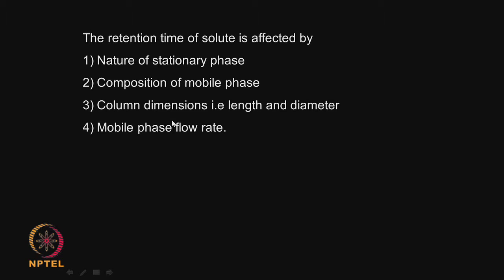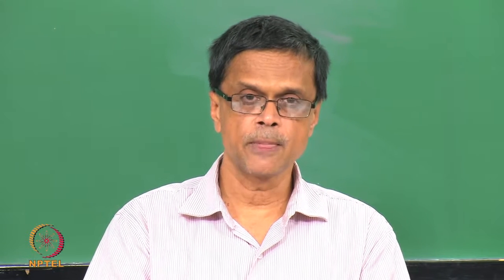Then column dimension, what is the length of the column, what is the diameter of the column. Then mobile phase flow rate, how fast or how slow the mobile phase is flowing through. All these affect the retention time. I am not talking about the separation efficiency, but just the retention time, that means what time it will take for a particular solute to come out.